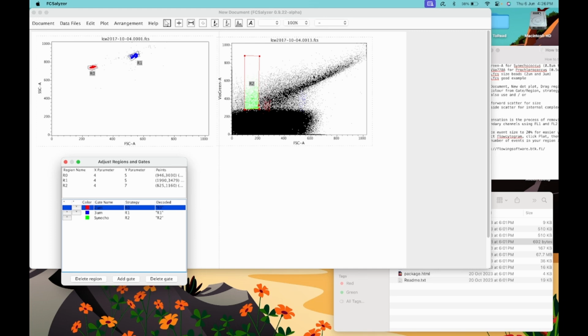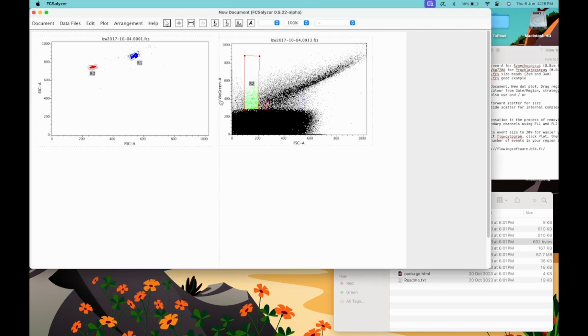Next, for Prochlorococcus, we will change the filter to APC VO770A. So these filters all cater for specific wavelengths. So you have to compare with the wavelengths suitable for the autofluorescence of the microorganism that you're interested in.